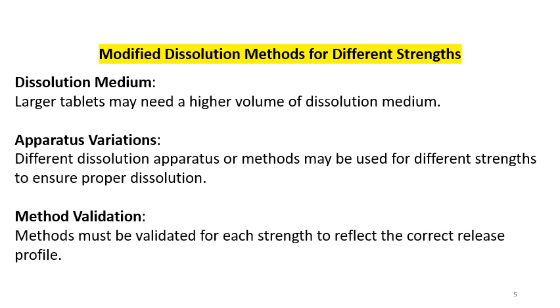So, how to tackle the sink condition problem? Generally, multi-unit dissolution is performed, and I am going to make a separate video on this topic in the upcoming time. But for now, consider the dissolution medium, apparatus variations, and method validation.